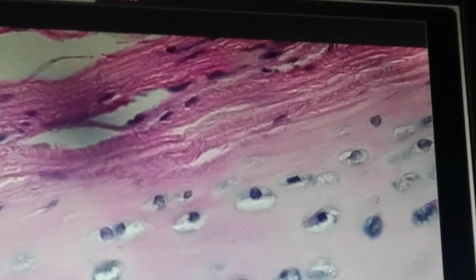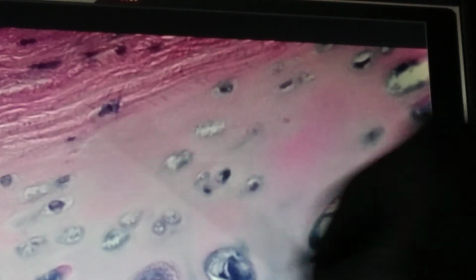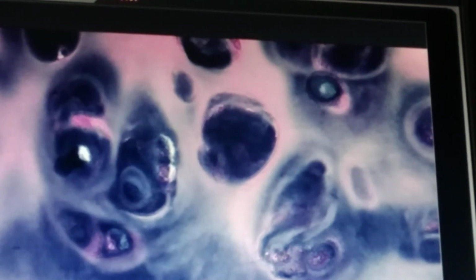I'm going to go a little bit up to show you the perichondrium. These are the perichondrium. They become flatter. If we go to the side, right and left, to show you more of these perichondria, these are the perichondria that we find. The last layer of the trachea is towards the outer part, with more chondrocytes. You see them here, a very typical shape. You won't miss them. If we adjust the focus a little bit, it's a little blurry here, to show you the chondrocytes.